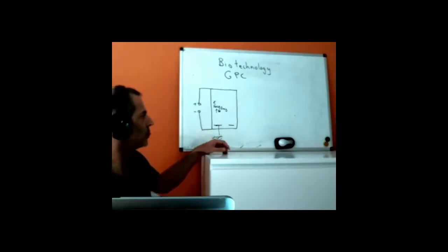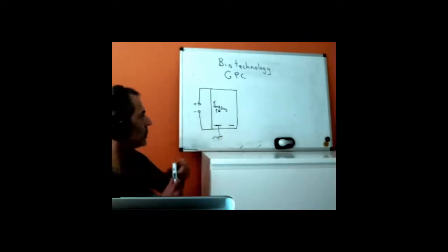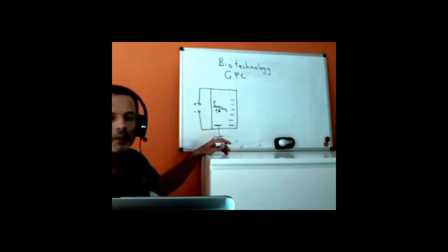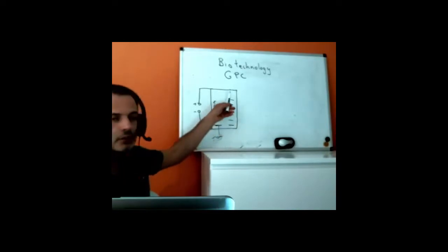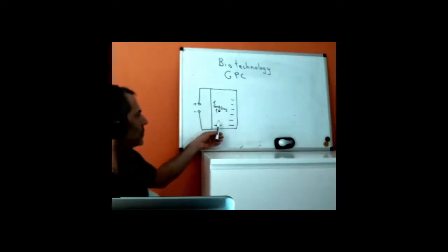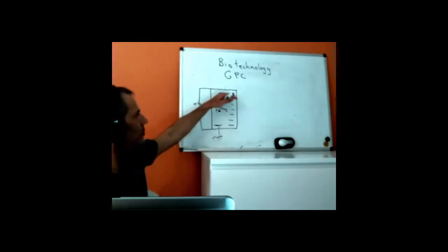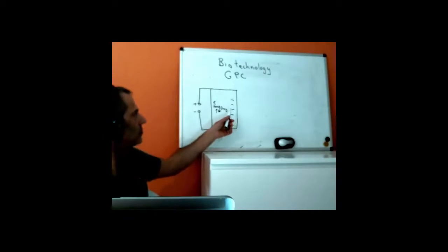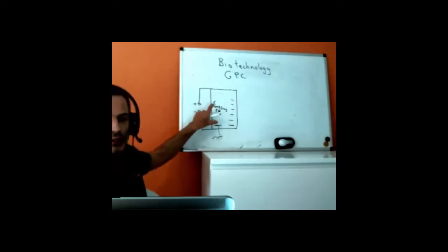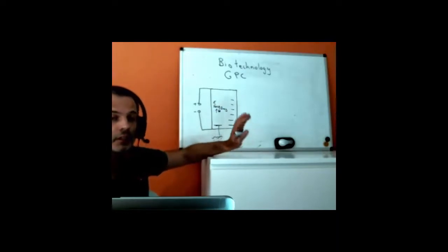To avoid that, we always run an internal standard, that's some DNA that we know the length of. We will get a set of bars, a set of measurements. So this is our DNA, these are different components of the DNA. We will get a set of measurements that we can use to determine our actual sample. And if it runs warmer, then these will move further, and we have to turn it off earlier. If it's colder, then they won't get as far. But if we stretch and compress all of the features using the standard, then we can compare two tests with each other and it works properly.